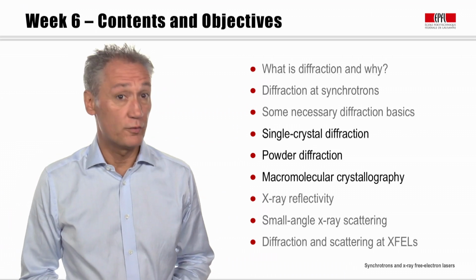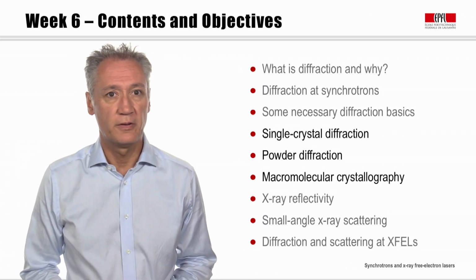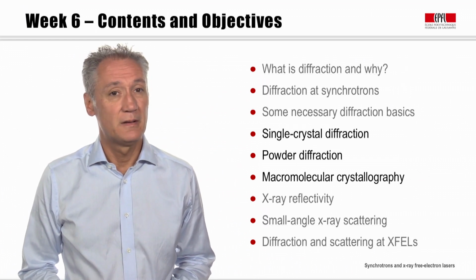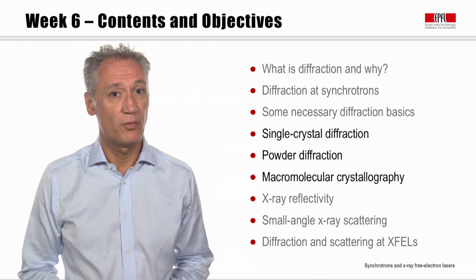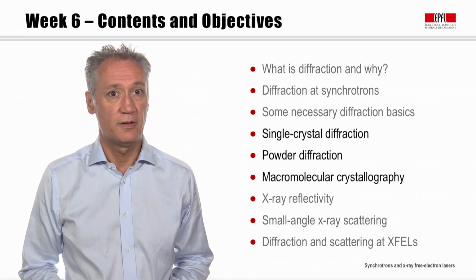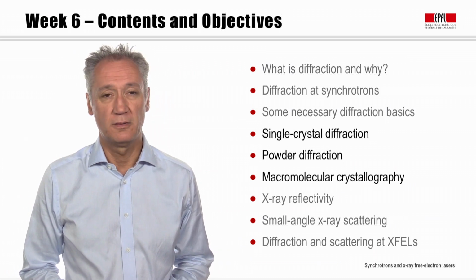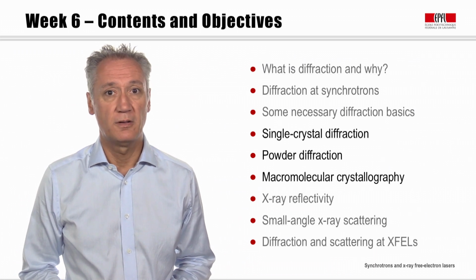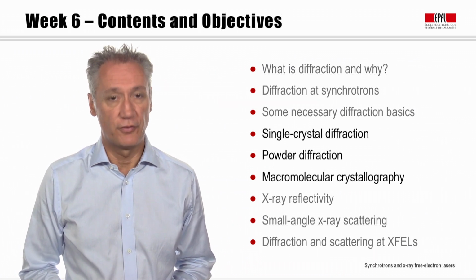Welcome to the second video of week 6 of this introductory course on synchrotrons and X-ray free electron lasers. Now this video is concerned with three of the most common variations of synchrotron-based diffraction, namely single crystal diffraction, powder diffraction, and macromolecular crystallography.